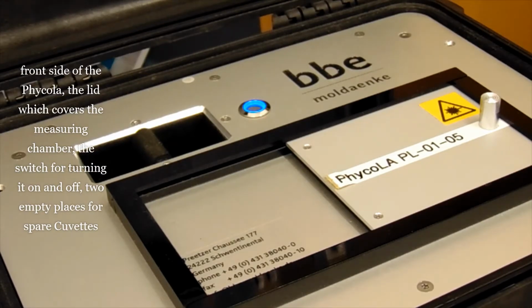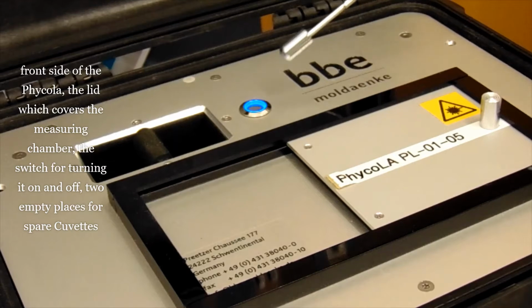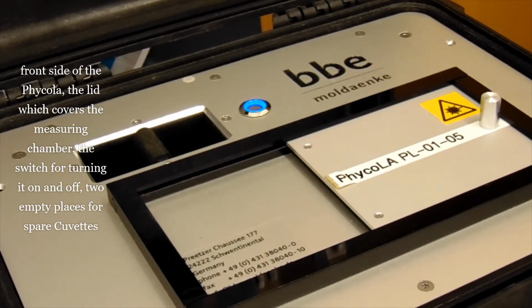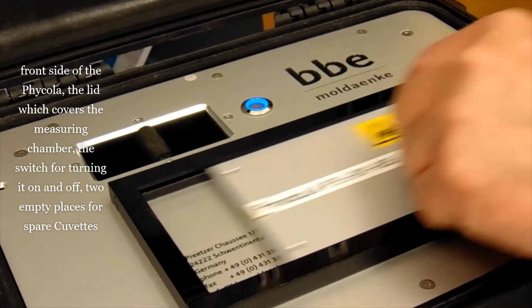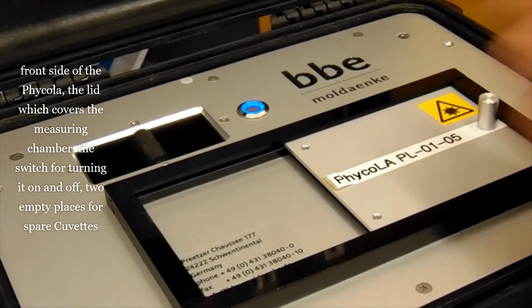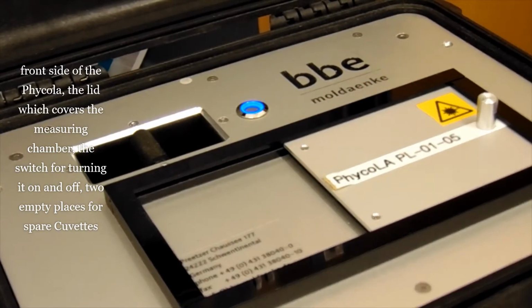Here we can shortly show you the construction of the PhycoLabAnalyser. Here we have the illuminated switch on. Then we have here the main component, that is the lid with the chamber for the cuvette. I can open it to show. You see it here, the cuvette. When it is closed, it is absolutely in the dark.